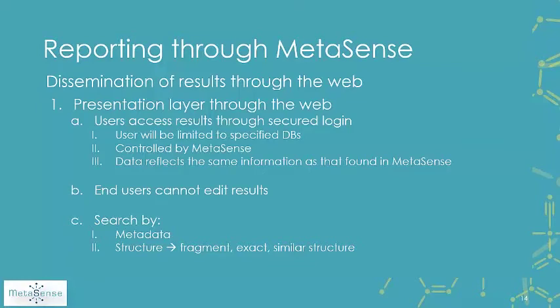Users will be able to log in through the web, but they will be limited to specified DBs that will be controlled by the MetID expert and controlled by MetaSense. The data that you see within the web portal will be the same as that found within the results of the MetaSense database. Once again, end users cannot edit the results.